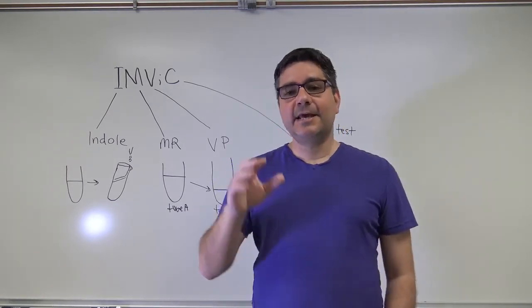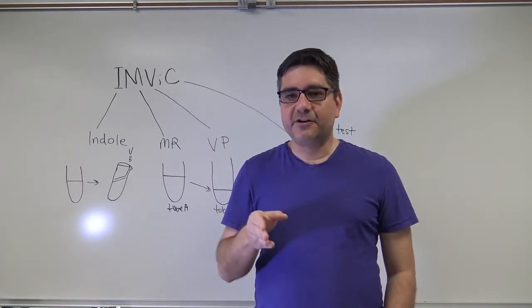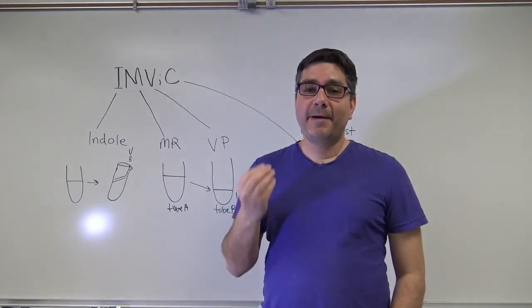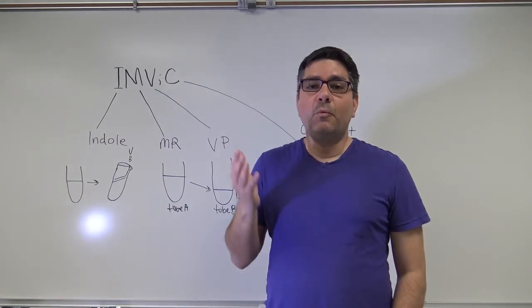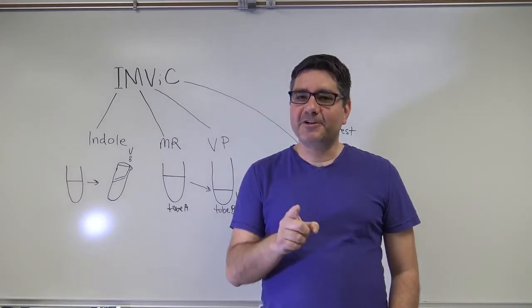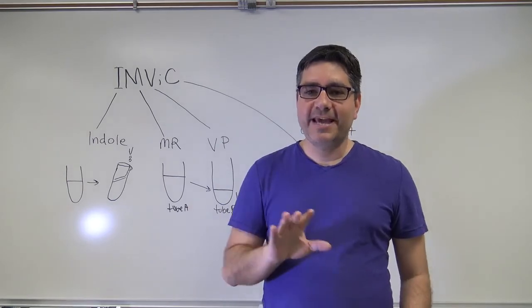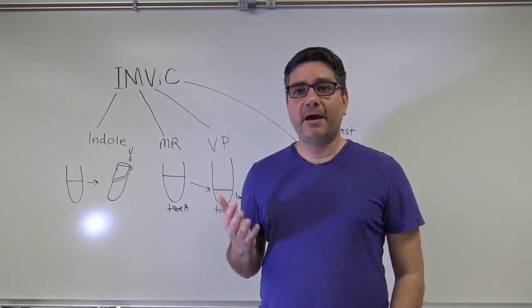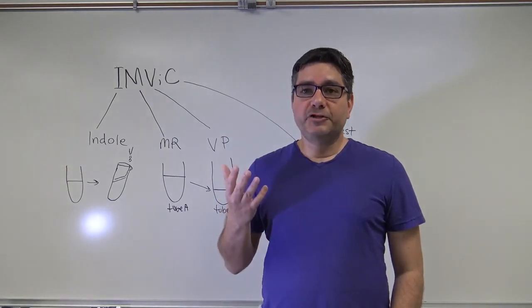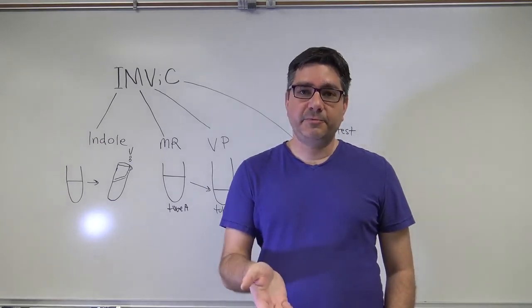To conduct this test, aseptically remove the organism from the culture tube along the slant surface. Place the organism on a clean and dry microscope slide and simply place 1 drop of hydrogen peroxide on the organism. Oxygen production will appear as bubbles and can be detected with or without the aid of the microscope. Depending on the amount of organism you place on the microscope slide will determine how much bubbling you may see in the drop of hydrogen peroxide.